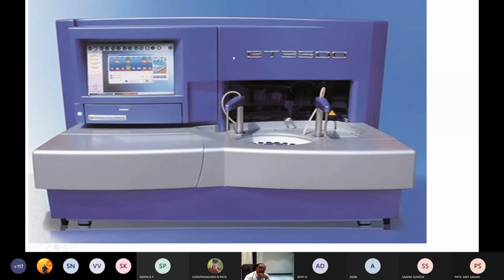Whereas the spectrophotometer has applicability in research laboratories. There is no speediness or hurriedness. No one will be sitting on your neck demanding the report. There you can use it. But the spectrophotometer has its own value. Compared to the colorimeter, the precision is very high. It's a very sensitive instrument, and all those things are covered here, and you can find those things in the fully auto analyzers.